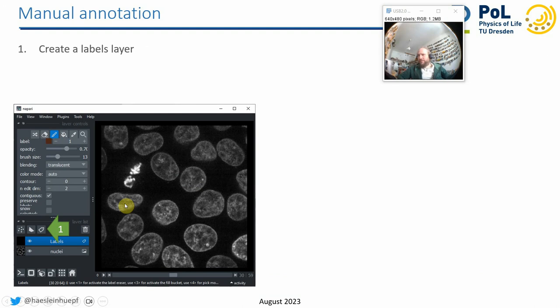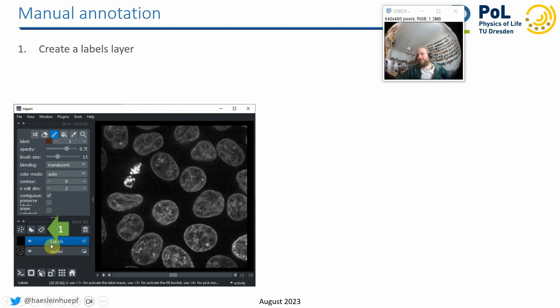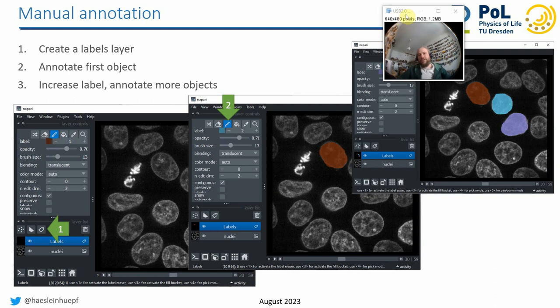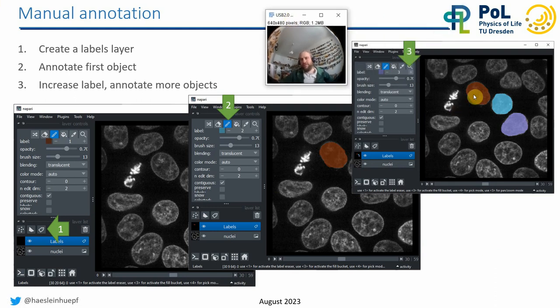A very common thing people do in Napari is annotating image data. You can click a button to create a new empty labels layer on top of your image. Then using the drawing tool, you can fill out a region to annotate a nucleus. If you want to annotate multiple nuclei with different numbers — nucleus one, nucleus two, nucleus three — you use the plus and minus buttons here to draw with a different label on the labels layer.